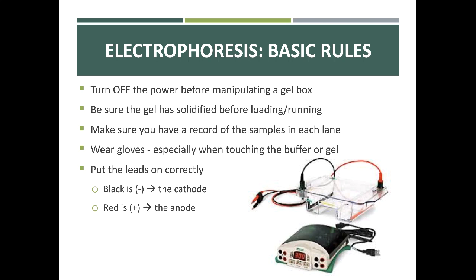But really, I don't care much for thinking about the colors of the cable. I really want you to know that regardless of the color of the cable, the negative has to be at the top of the gel and the positive has to be at the bottom of the gel.